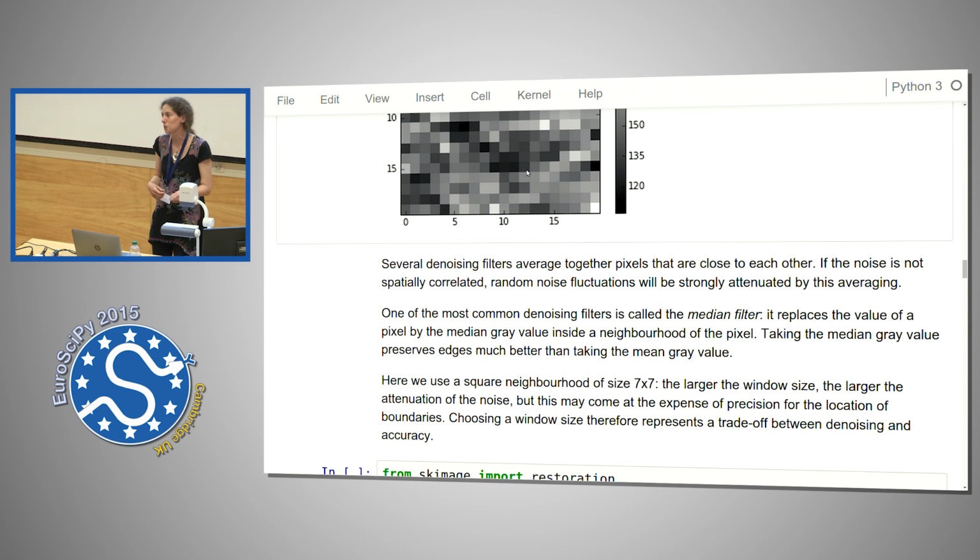People use it a lot to have better looking images. But if you want to have an accurate result, if you want to preserve features and edges, then a median filter will do a much better job. So, as you asked the question, you have to select the size of the window in which to compute the median value. So how should you do that?